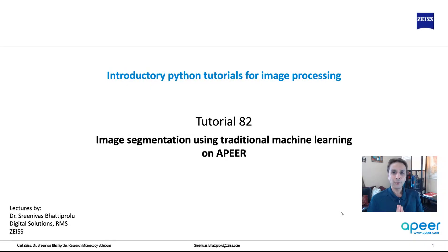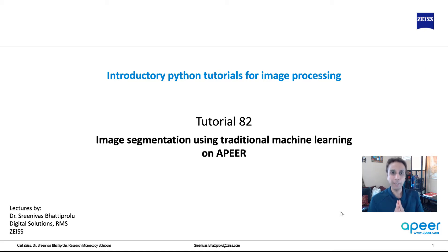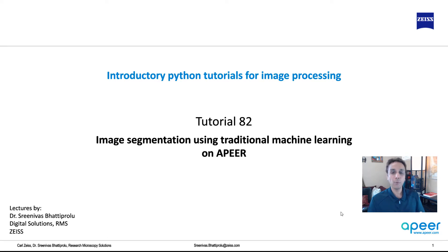Hi, everyone. Welcome to tutorial 82 of our introductory Python for image processing tutorial series. In this video, I'm going to show you how to do image segmentation using traditional machine learning, but on APEER.